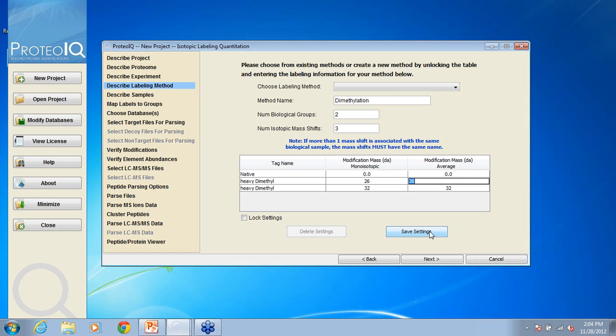All right, so Eduardo, what that entails is going to the program data folder, finding the ProteoIQ folder within program data, and just copy and paste the ProteoIQ folder somewhere else, and then just do the 2.3 uninstall and a 2.6 install, and you should be okay. Yeah, you actually do not need to uninstall 2.3. 2.6 can install right over it.